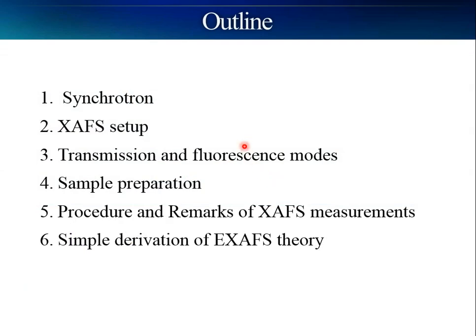Let me give you the outline of this lecture. First, the synchrotron will be addressed for comprehensive understanding. Next, the overall XAFS setup will be demonstrated. As you know, there are two measurement modes for XAFS: transmission mode and fluorescence mode, so they will be explained in detail.